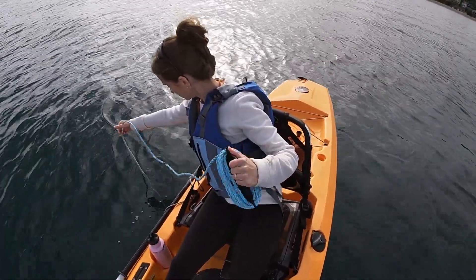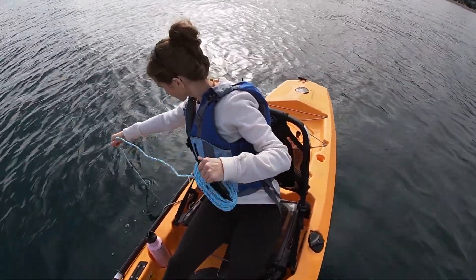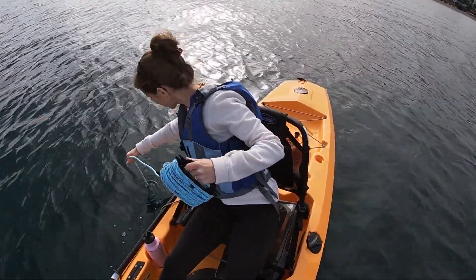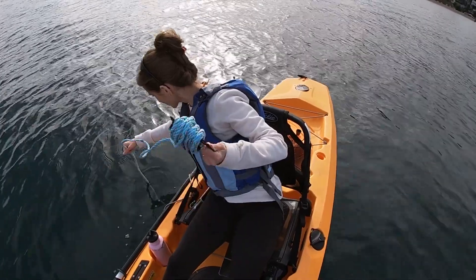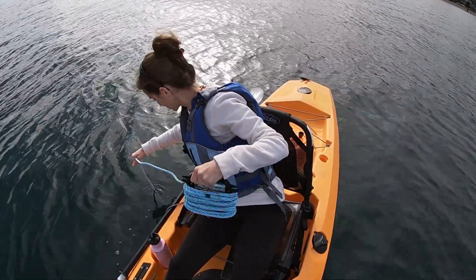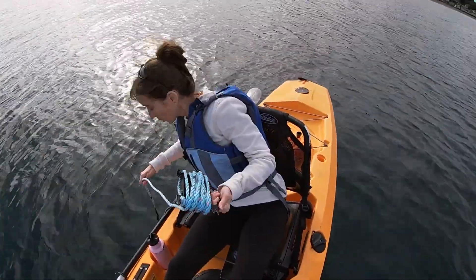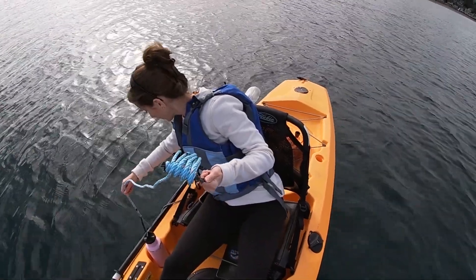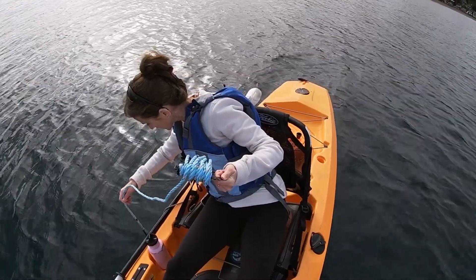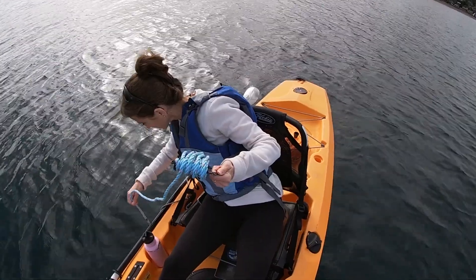Now it's down to two meters, still very visible. Three meters, there's four meters, five meters, six meters — definitely getting more difficult to see. Now it's at seven meters and I can just barely see it. I'm going to pull it up a little bit, then let it go back down to seven. I'm going to call that a seven meter depth.